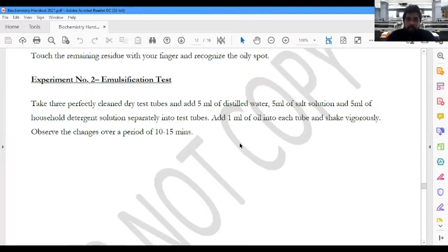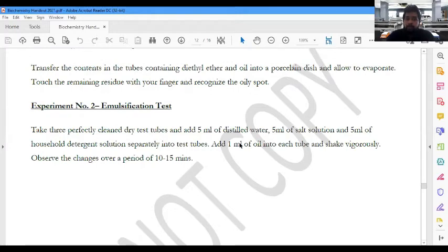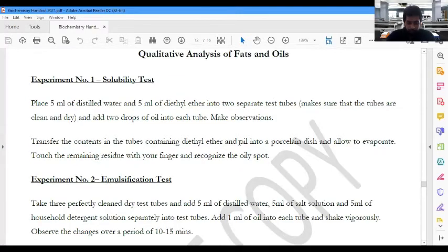Other than that, you have learned about one test to identify the presence of unsaturation, or to distinguish saturated and unsaturated fats or fatty acids. That's a very famous test that you have used in your organic conversions. What is that test? Can you remember?